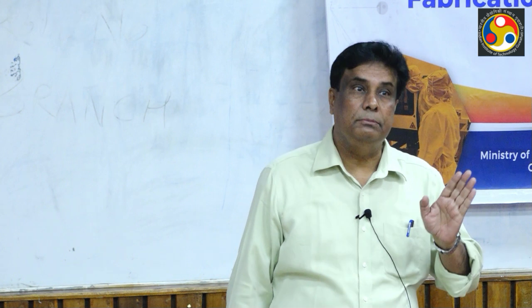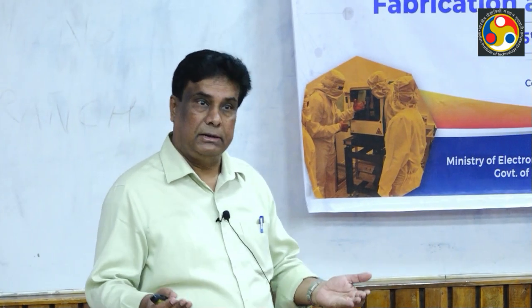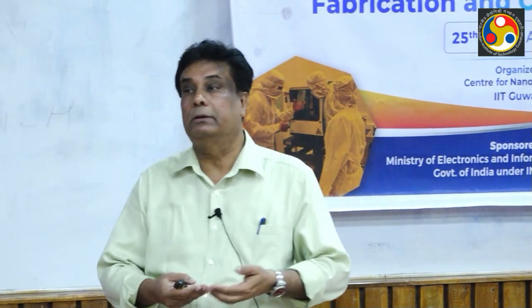Why do we need microscopy? To see something we can't see with the naked eye. When we talk about the microscope, it is in the range of microns, micrometers. Our eyes cannot see at the micron or micrometer level, so you need microscopy. That's light microscopy.